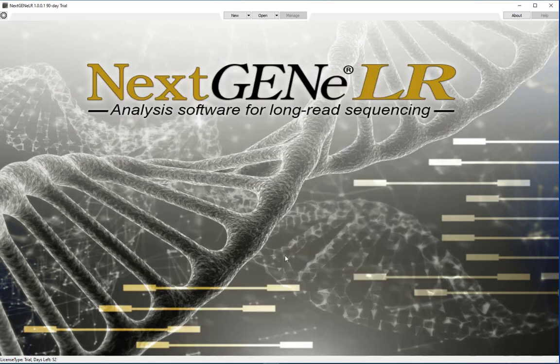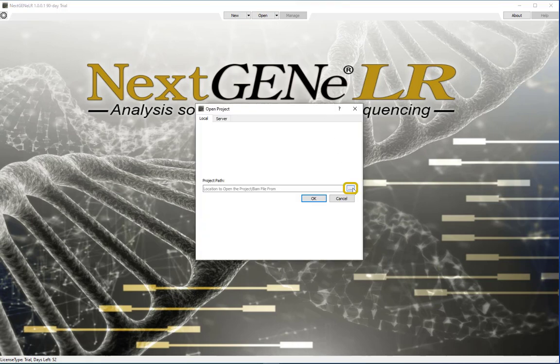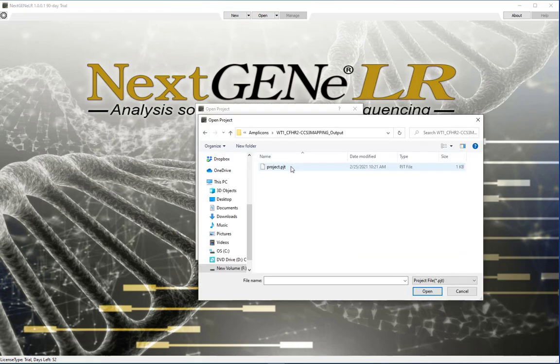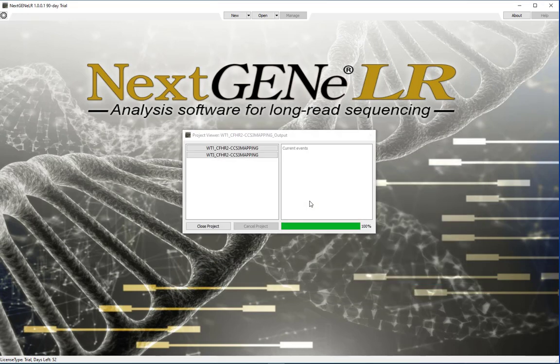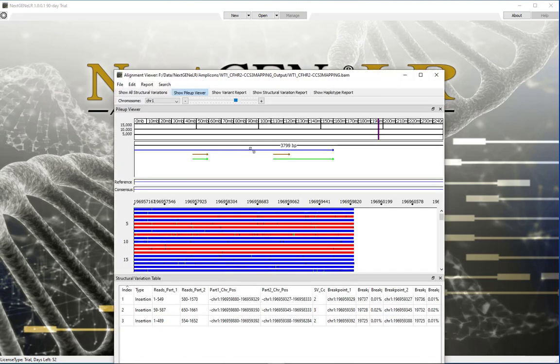Samples can also be loaded in the viewer later using either one of two options. First, you can load the full project in the project viewer again by clicking the down arrow next to Open and selecting Open Project. Then click the button to browse to the location where the project.pjt file was saved, then click OK. This will load the project in the project viewer with the buttons active for each sample. Click the name of any sample to open the sample in the viewer.